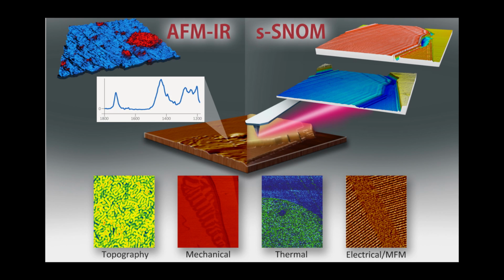How many chips? No, it's based on a different technology, and so it's a single crystal technology that tunes over that full range.